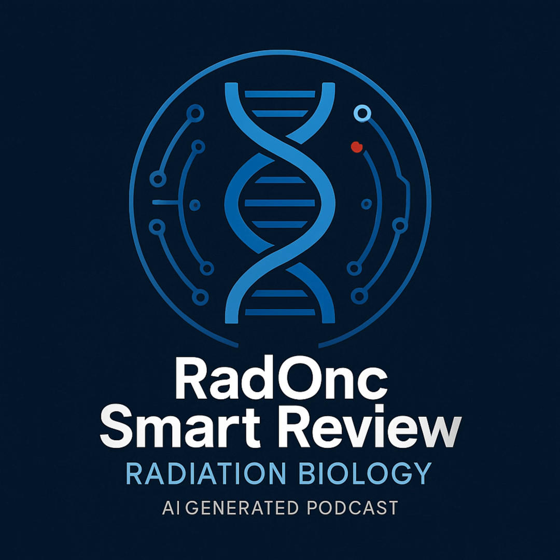Exactly. And like any copier, you need the right stuff. You need your DNA template, that's the starting material with the sequence you want to copy. Your original document. Then primers. These are short, single-stranded bits of DNA. They're designed to stick, or anneal, just before and just after the region you want to copy. They basically tell the polymerase where to start and stop. Like highlighting the bit you want copied.